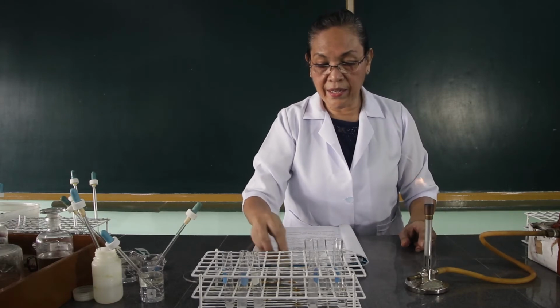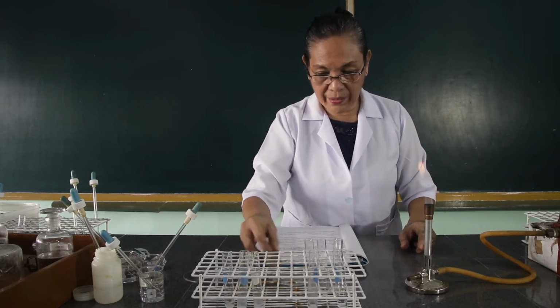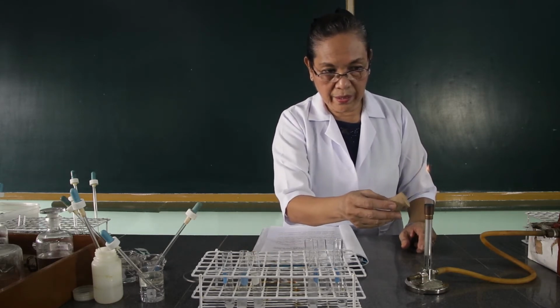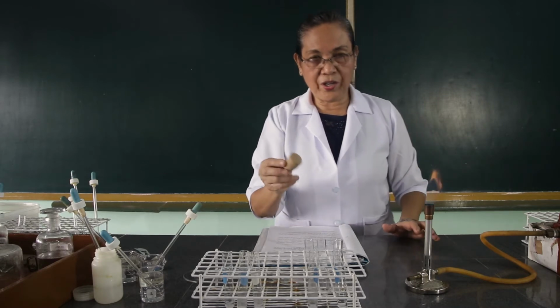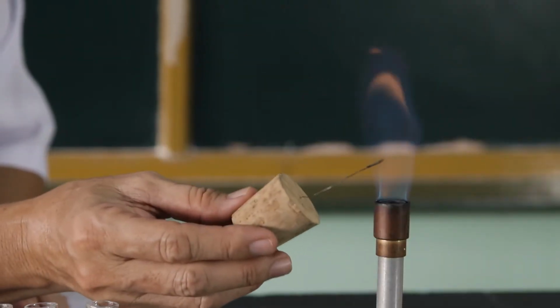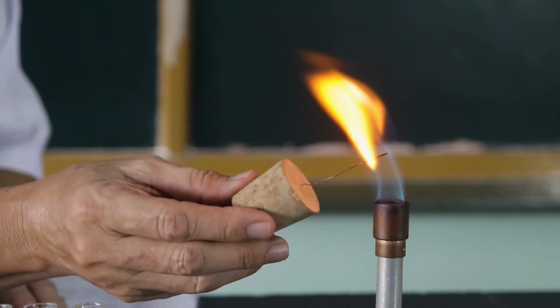So there is still the color of barium. Repeat until no more color of the barium is imparted. Repeat. Okay. Kindly observe the color of the calcium ion. So we are done analyzing the calcium ion.